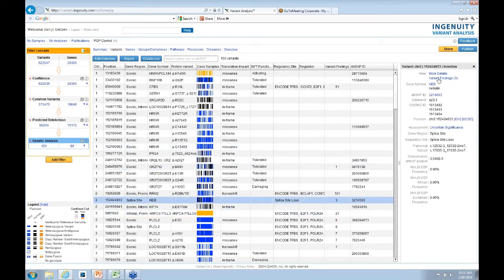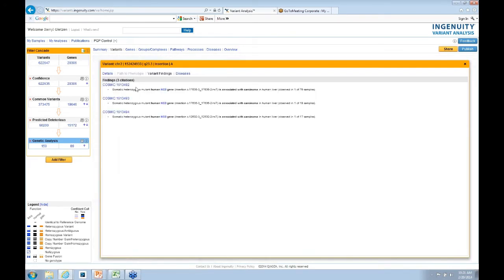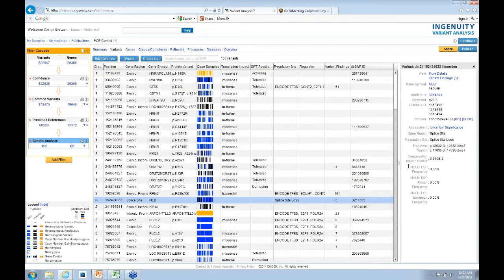Here's another one where if I go look at the variant finding, I have 3 COSMIC entries here, all different study sizes, and this is information that we've curated from our knowledge base. By the way, I'm not COSMIC. We pulled in COSMIC, but like the PLOS article, we're investing a lot of money in curating this variant content from the literature. But you can see people are reporting these variants as being important. You can see the frequencies down here are all essentially 0.